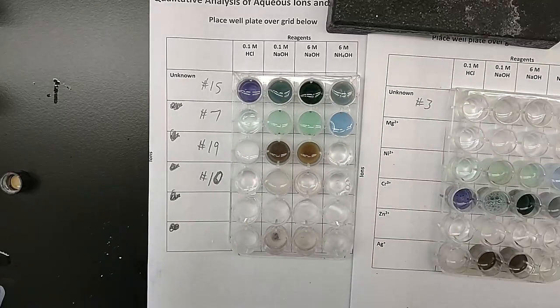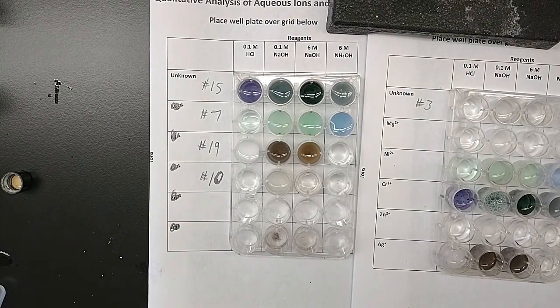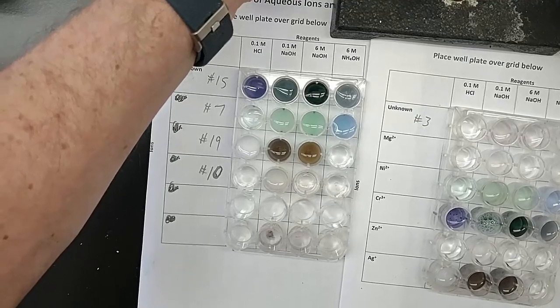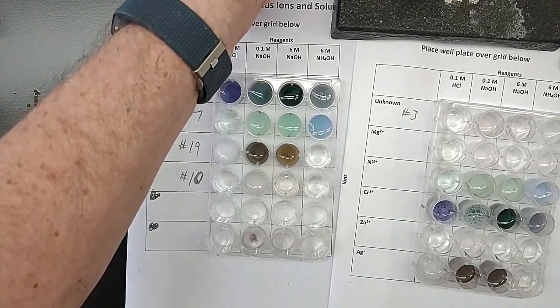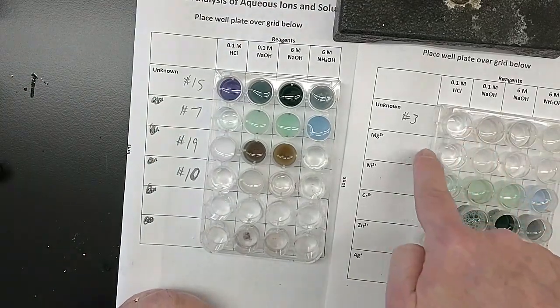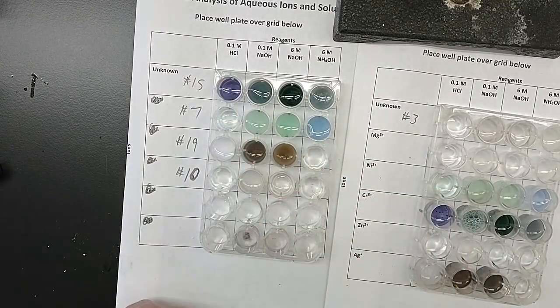So let me unzoom. And we can compare carefully. Unknown number 3 to magnesium, to nickel, to chromium, to zinc, to silver. Number 15, number 7, number 19, and number 10.